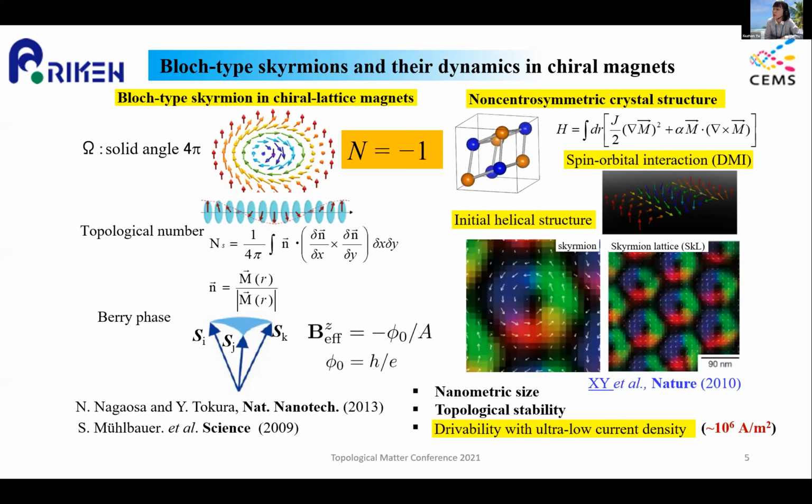I think our center director, Professor Tokura, will present some exciting electromagnetic phenomena in the chiral magnets this Thursday. Today I skip the introduction for these phenomena. I focus on the real space observation. And here I show a Lorentz TEM image to view the twisted spin texture in a skyrmion and also a skyrmion lattice.